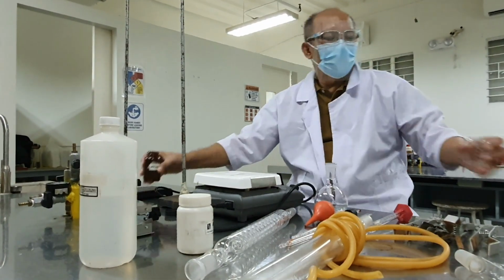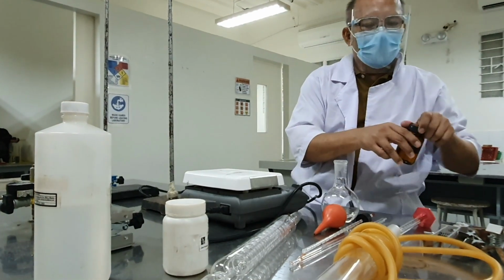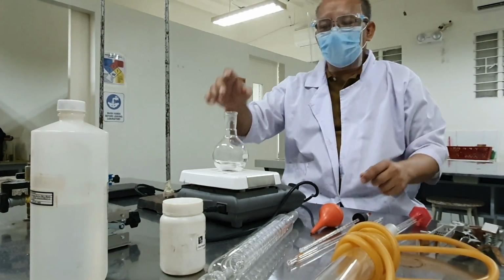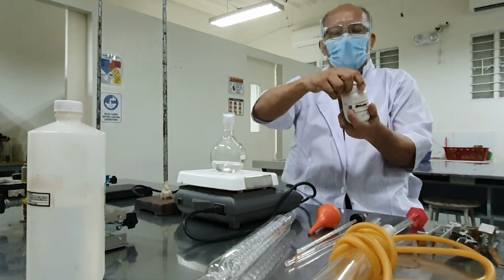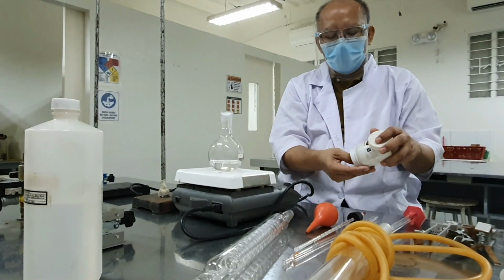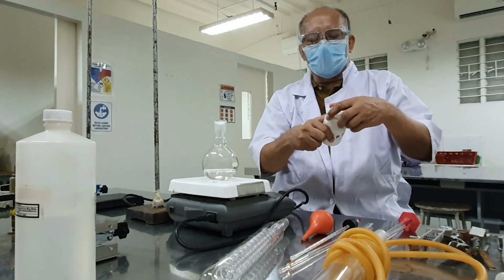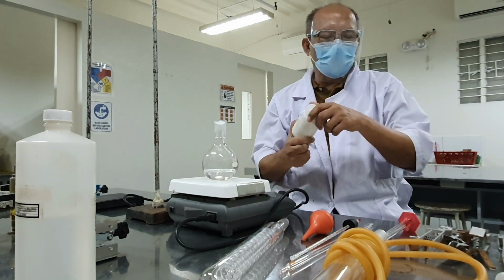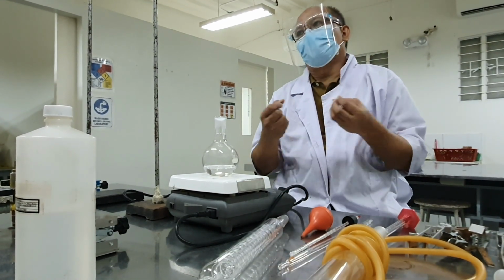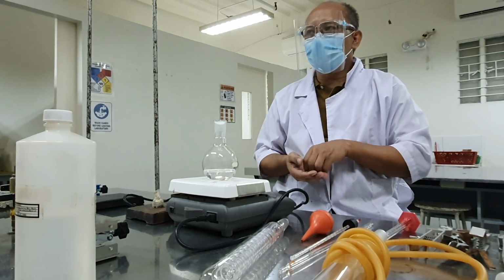You have to be very careful because your mixture is flammable. Before you connect, we are going to add a few drops of boiling stone. The role of the boiling stone is to break down the formation of big bubbles, because big bubbles will cause the solution to explode, so it might break the flask.